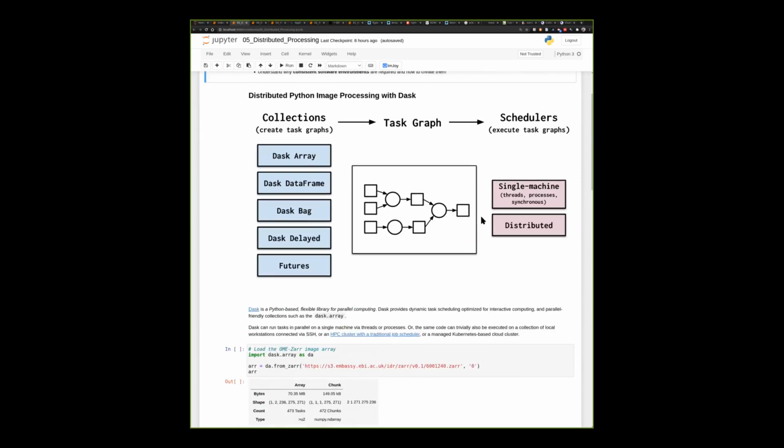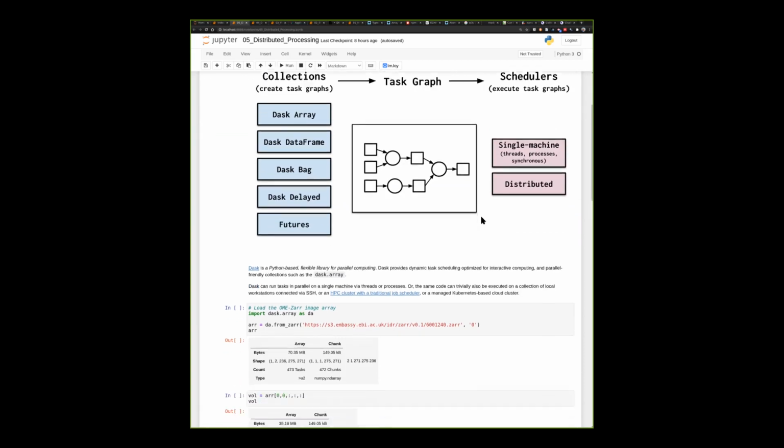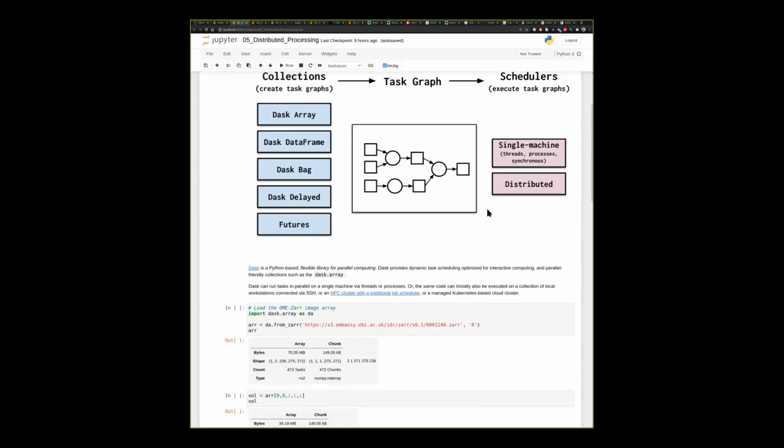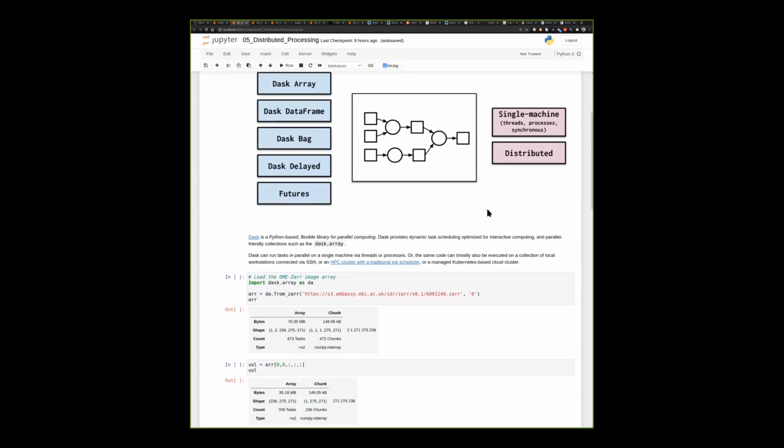Any questions about that? It'll be a little clearer once we start to use it and we can actually see how it works, what's happening.